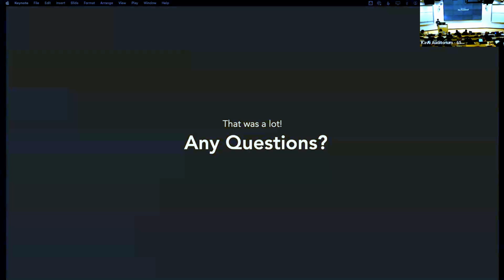One is, you may have touched on it earlier, in the calmodulin case bound to the channel, is there a way of actually determining what fraction of them have only one, and how could there be two just because of mismatch and misclassification, or is there definitely two because sometimes there really are two?